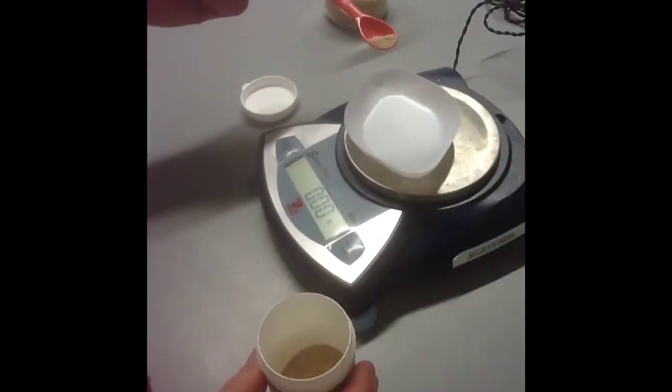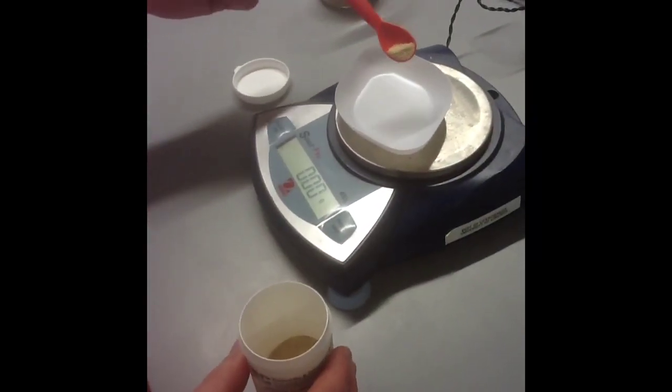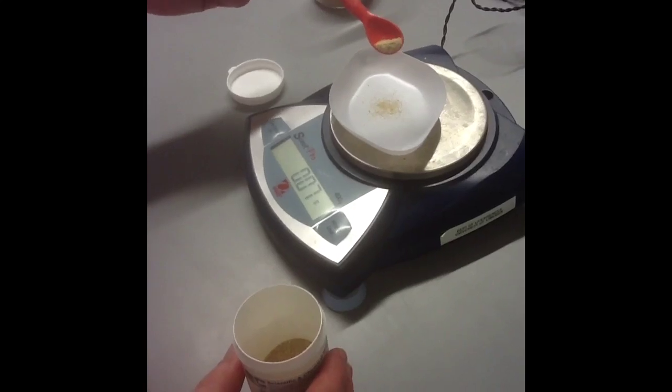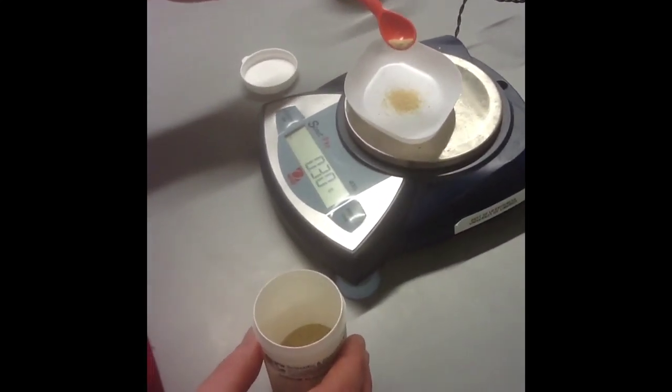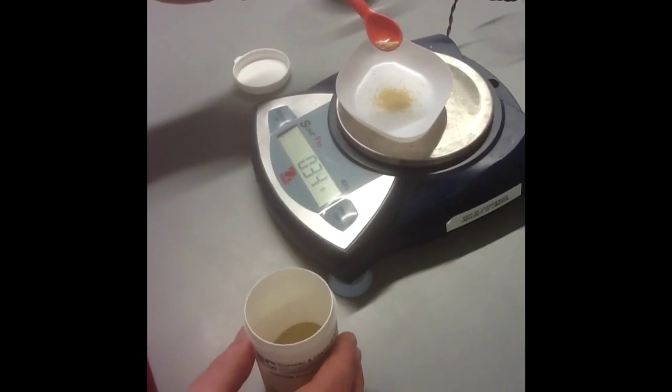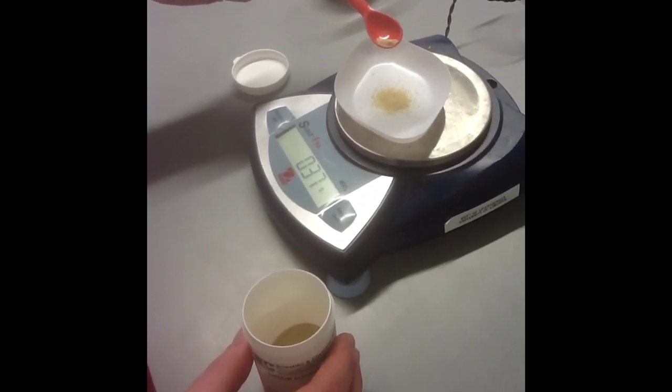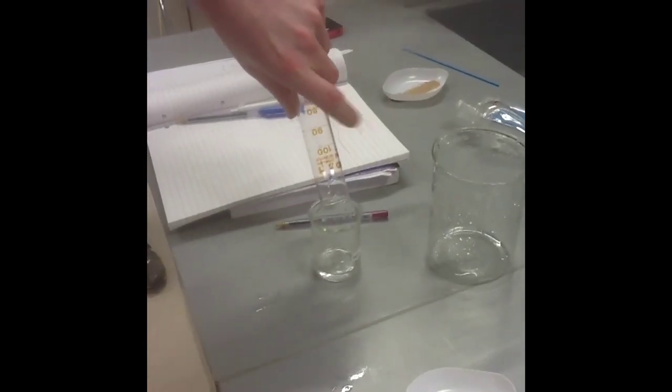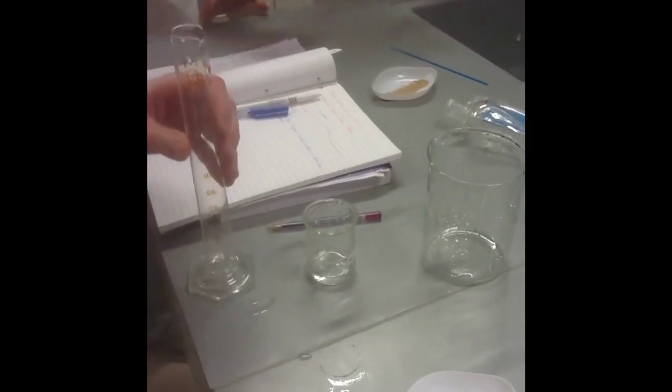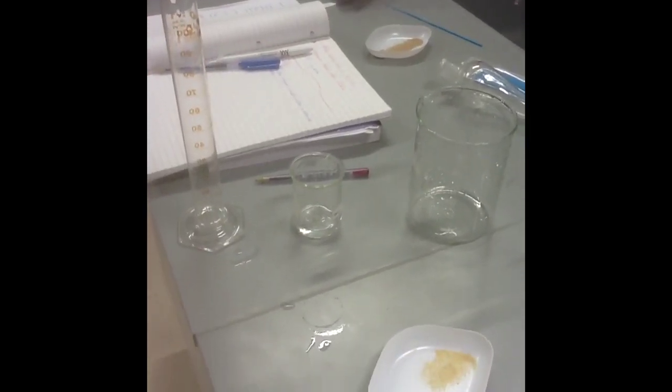The first step is to weigh out 0.4 grams of sodium alginate. Watch out, this might be tricky. Almost there. Boom. Then add the sodium alginate to 10ml of distilled water in a 100ml beaker. Make sure to stir well.